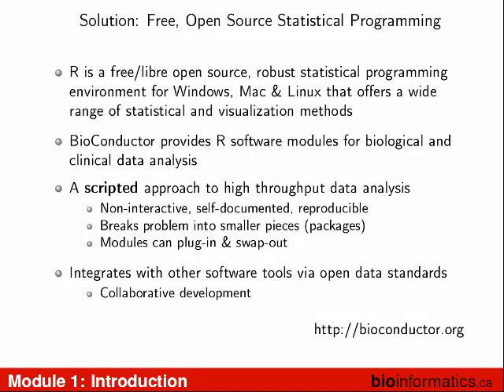It may be hard to find, but you can debug it and work it out, and eventually it's black and white. And with a bit of hand-holding, you can usually figure things out. And what's wonderful with Google now is that when you have a problem, there's going to be 50 people who have the same problem you do. And we won't do this today, but maybe we will. If you have a problem, you just copy that error message, paste it into Google, and usually someone will find that answer. This is what I do in my day-to-day life.